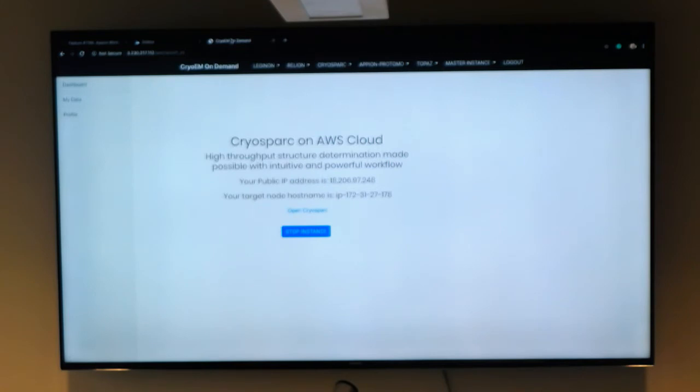Unlike for Relion, where each of you had separate instances, we're all going to be sharing one instance, but we're going to spend a little bit more money and get more GPUs, and that will assist you. Since we're working in groups, hopefully it won't be too much of a lag for you to submit jobs and see outputs.